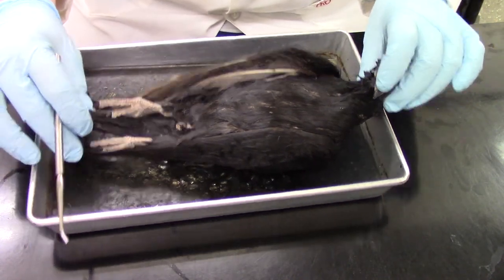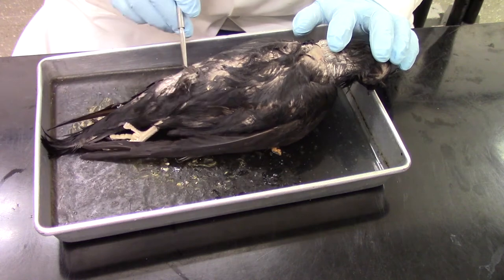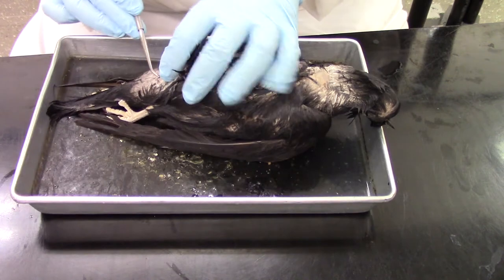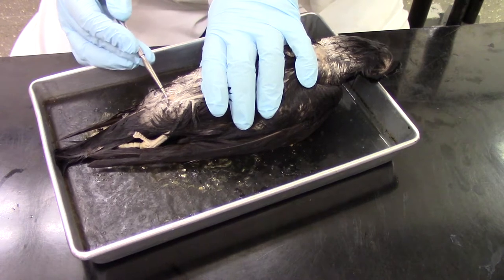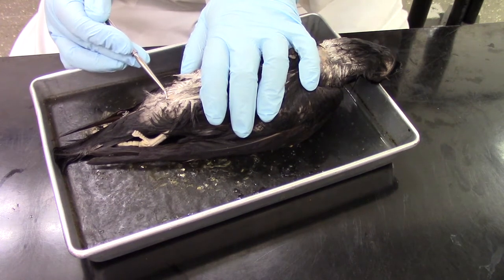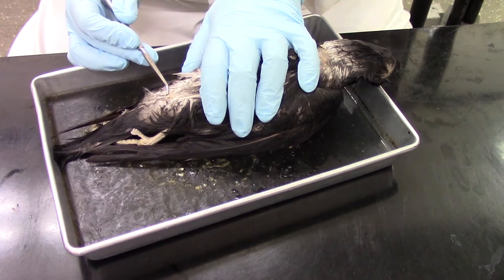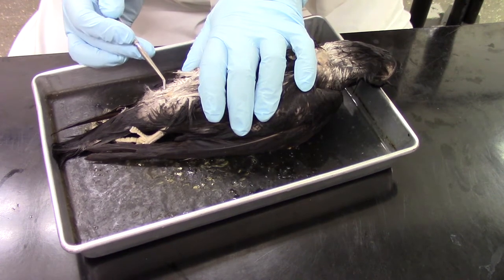If we turn it the other way so that we're looking at the dorsal side, and go right near the tail, if we move some feathers off to the side, we have one structure we want to identify. Right here we have a little pointed bit and that is the uropygial gland, sometimes also known as the preen gland. That's going to produce oil to help give waterproofing to the feathers and aid in preening.